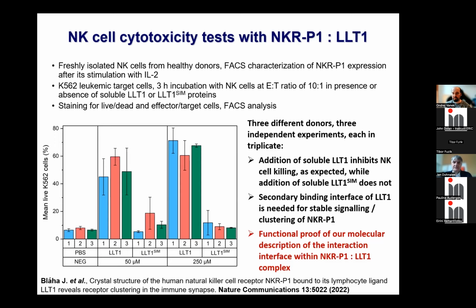I guess labeling would be really necessary here. I mean, they are tiny. Yes, they are tiny. But for another complex that I mentioned in the beginning, NKP30B7H6, where the receptor itself is forming oligomers, we are following that by cryo-EM single particle. And to increase the resolution, we plan to use nanobodies in form of megabodies to help that. So maybe this would be the approach here as well.